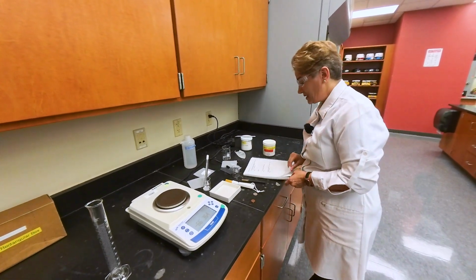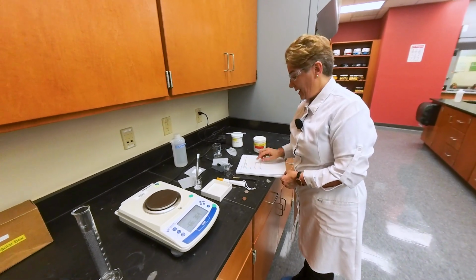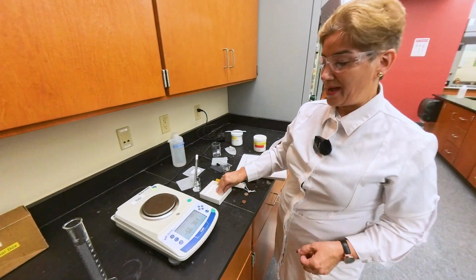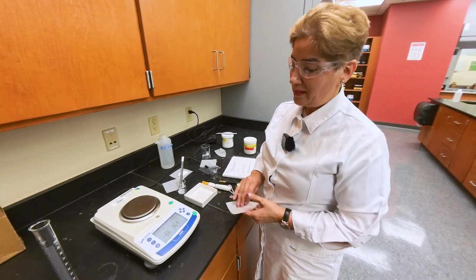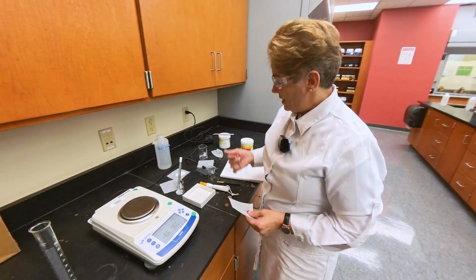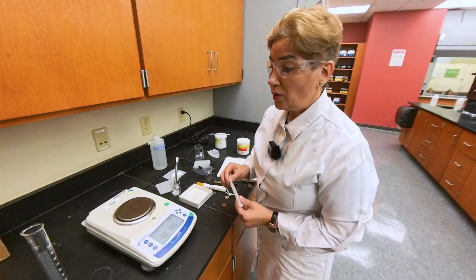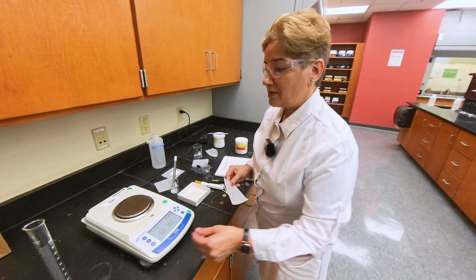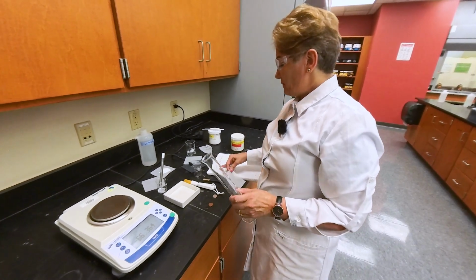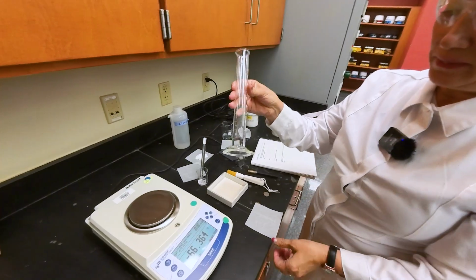Next step is measuring the mass by difference, and to measure the mass by difference, we are going to need the mass of the container and then the mass of the container plus the sample. The first, if you look at the worksheet, is asking for the mass for 50 milliliter of water in a graduate cylinder. So I need the mass of the graduate cylinder by itself.